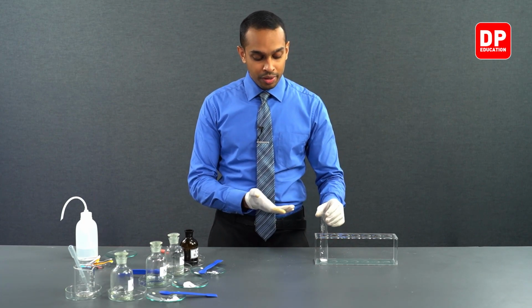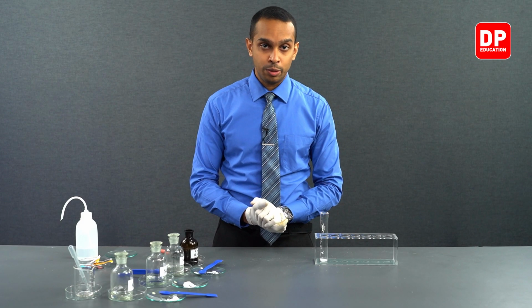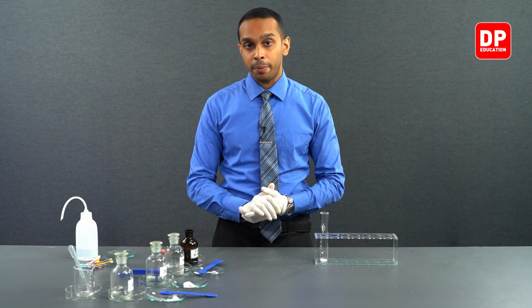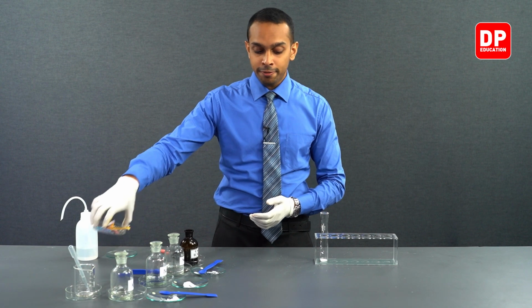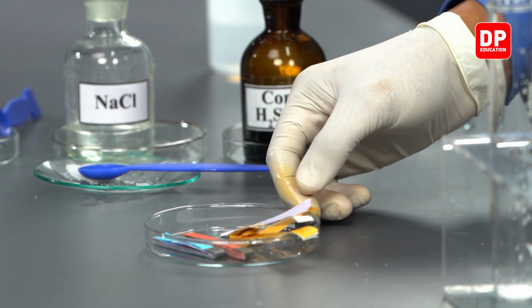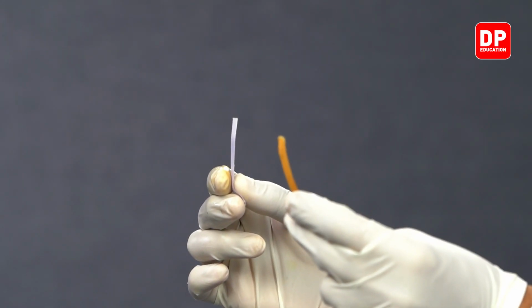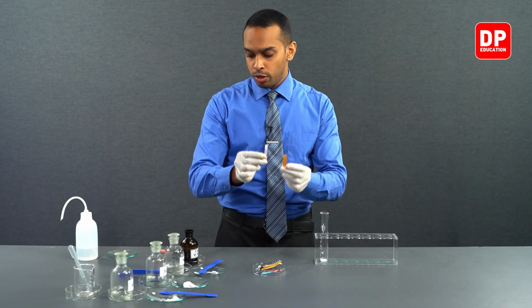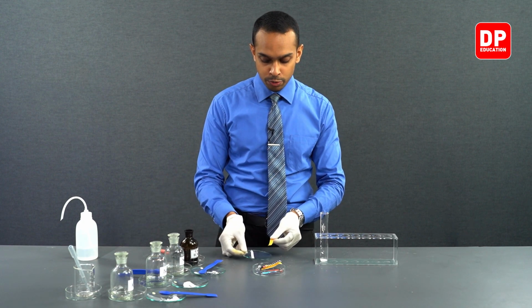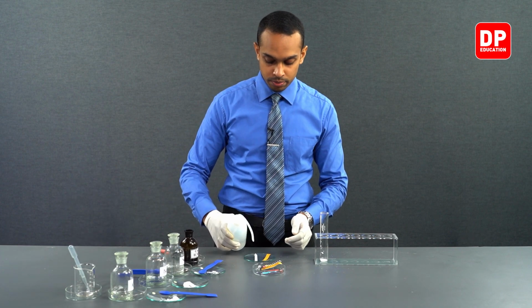The HCl gas can be tested with blue litmus paper, and at the same time we can use pH paper to identify how acidic this gas is. Here in this petri dish we have blue litmus paper as well as pH paper. To use them, we have to make sure that these litmus papers are wetted with a little bit of distilled water.